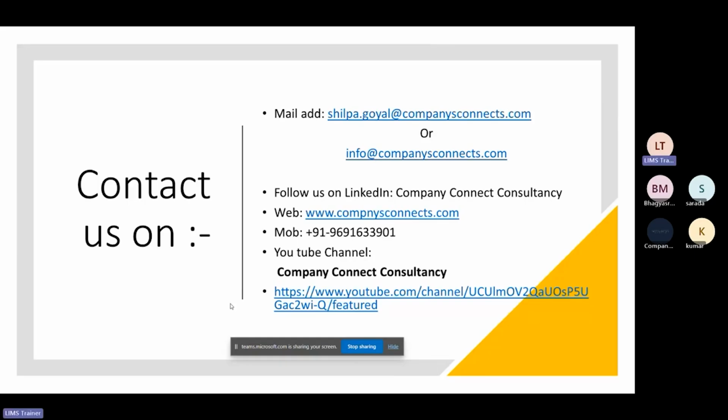Yes, that course is different. There you will learn the administrative part. As I have explained, administration is a different thing. There they control a laboratory, like the login credentials, and whatever problems are generated in a particular laboratory will be handled and taught there in the administrative part. And here we will look into all the LIMS modules, how you can employ them, and how you can adapt everything to grow in your career.